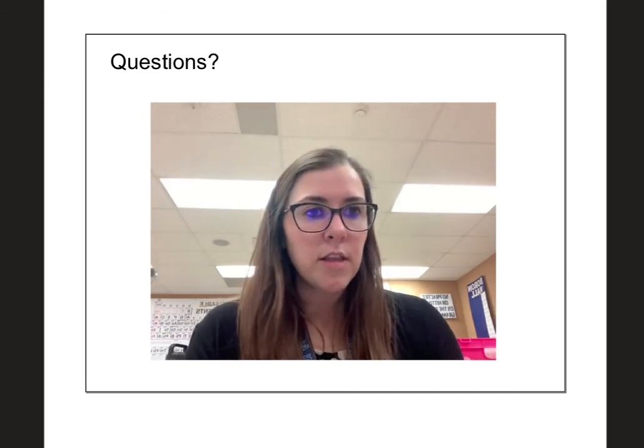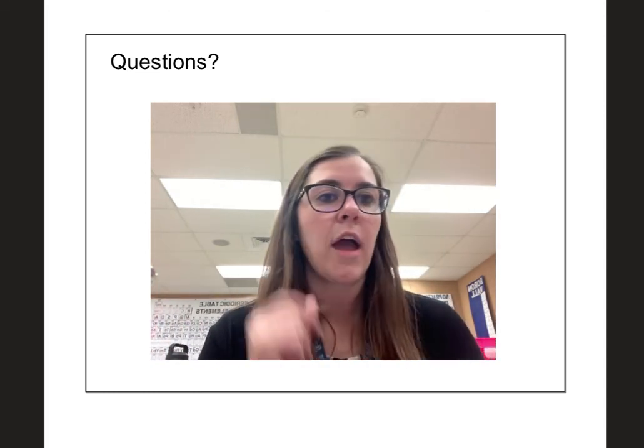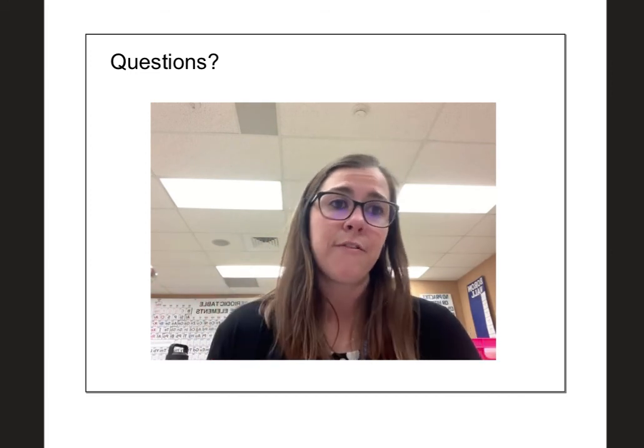Maybe one person starts doing the filtering, the other person starts getting the HCl ready for your first round of titration, so that way you can hopefully get through 2 or 3 trials in a 50-minute class period.